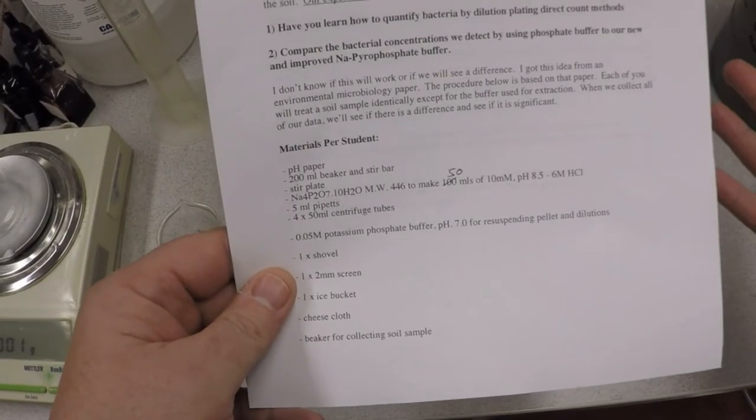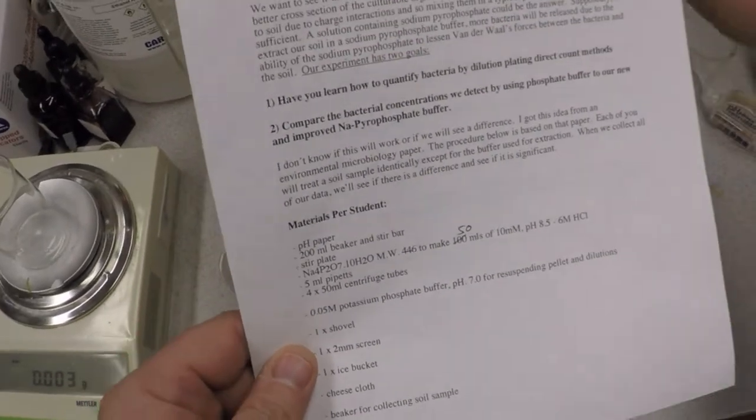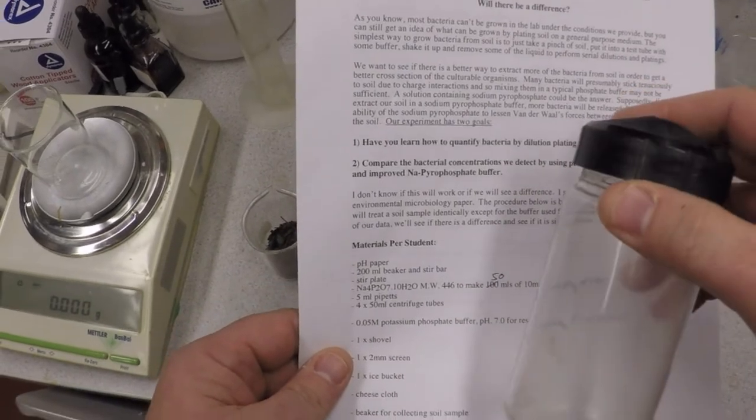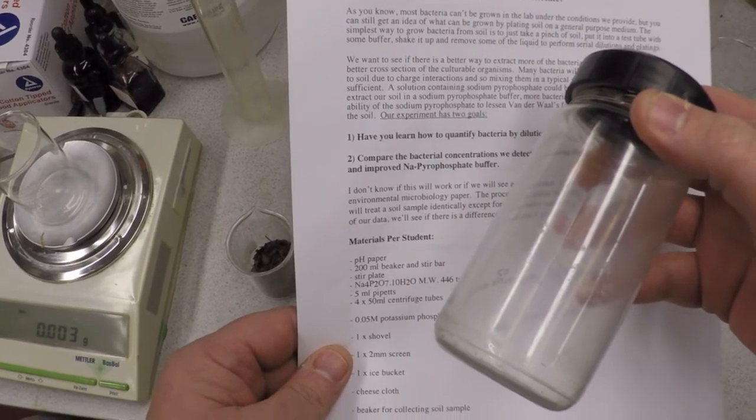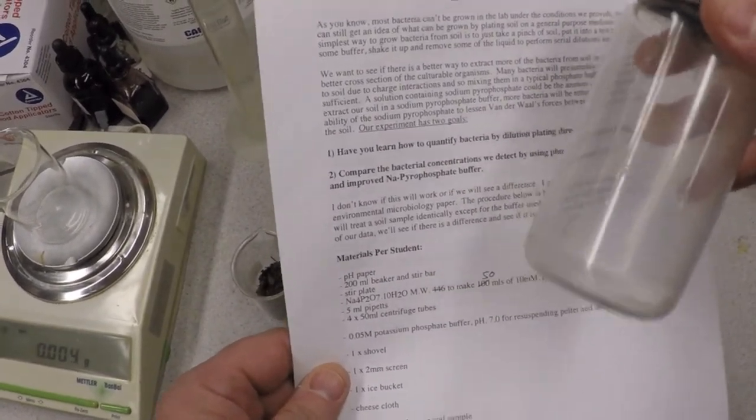You're going to have pipettes available for pipetting things. You're going to probably use these big centrifuge bottles because I'm not sure what kind of centrifuge we're going to have available to us. These will go into the big gray centrifuge that's in 165 and we'll probably go over there and use that.